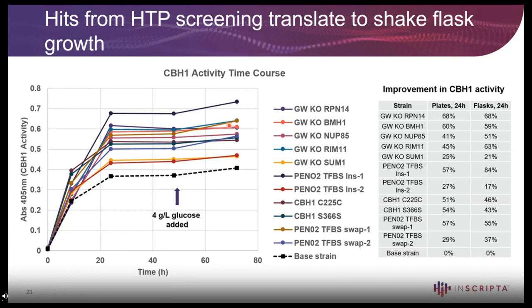I also wanted to look at what the fold improvement is that we get in flasks versus plates. And I picked this 24-hour time point in order to do this calculation because those are the time points that were in common between the two scales.